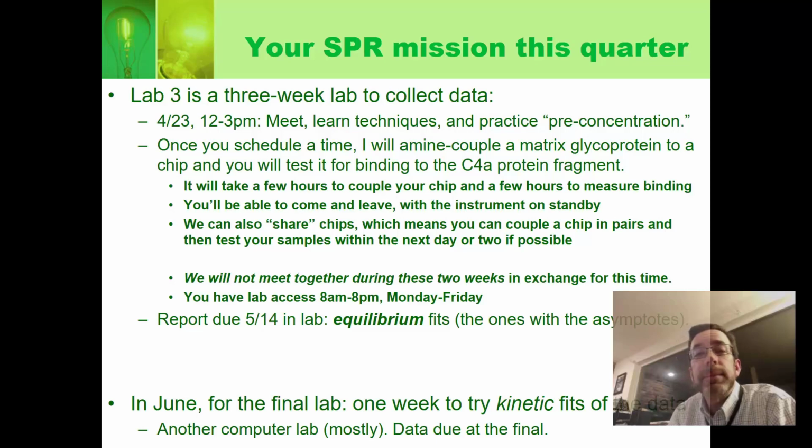Once you schedule a time, I will do the amine coupling. I'll give you a chip, and I'll assign you a C4A protein fragment. And you'll have to schedule, oh, and by the way, I'll take the time to couple my chip, and it'll take a few hours at least to measure binding. Probably overall about 4 to 6 hours, although you can do those in different chunks according to your schedule. You can leave the instrument on standby. We're going to share chips, and so it's just going to matter when you sign up on the schedule, because I'll be able to tell what chip to have in at what time. Okay, so it's just important to stick to the schedule as you have it once we set it up.